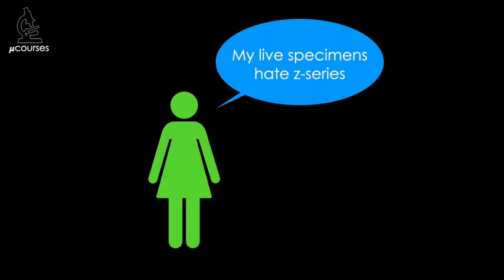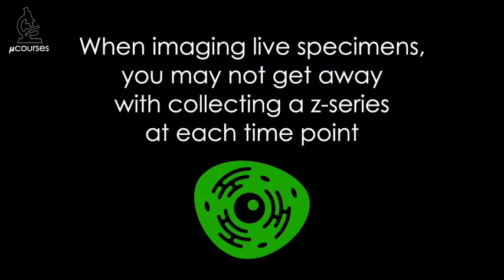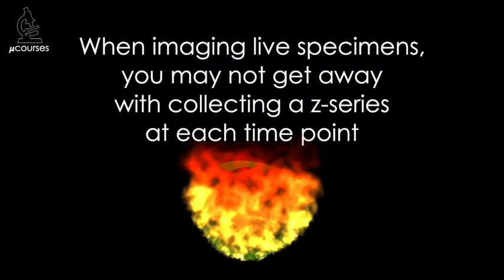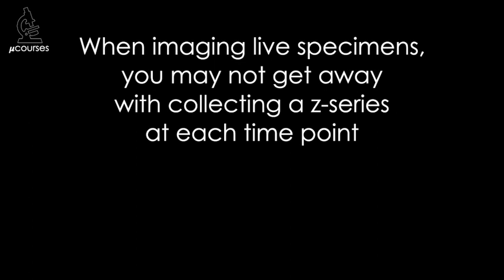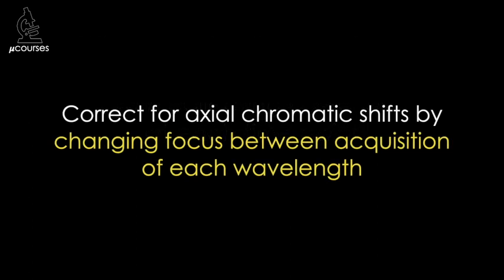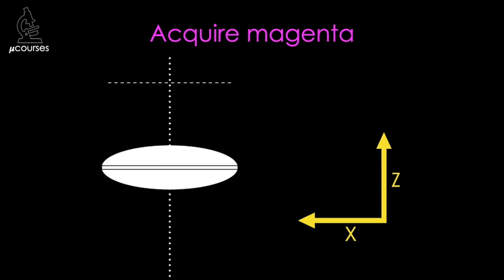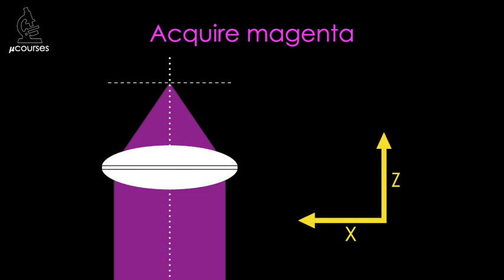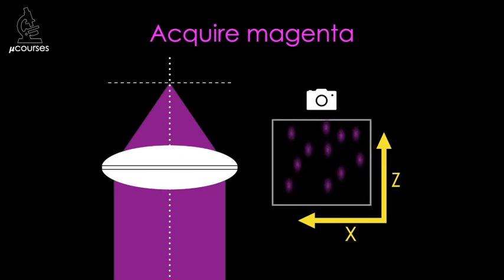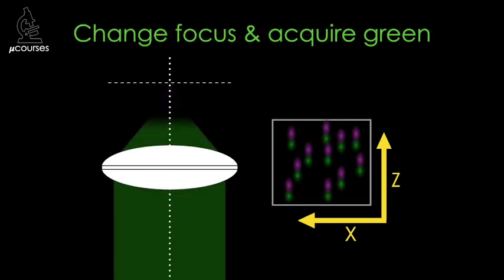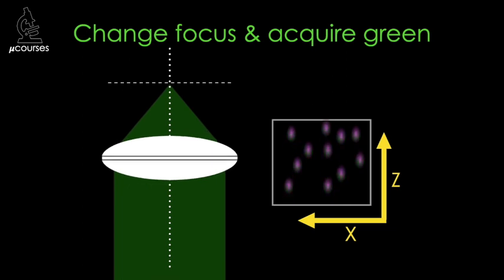If you need to correct for chromatic aberration in live specimens, you might not be able to get away with collecting a Z-series at every time point. In this case, you can take another approach: correct for axial chromatic shifts by changing focus between acquisition of each wavelength. Most image acquisition software can be set up to move the focus motor between images — this allows you to focus on one wavelength, change to the next wavelength, move the focus motor by the measured axial shift, and then acquire the next image.